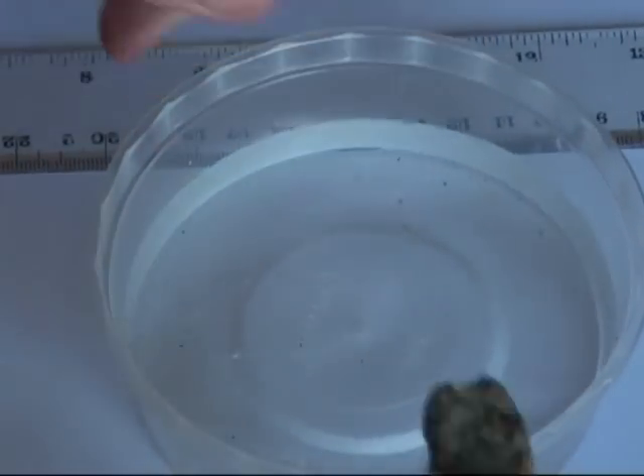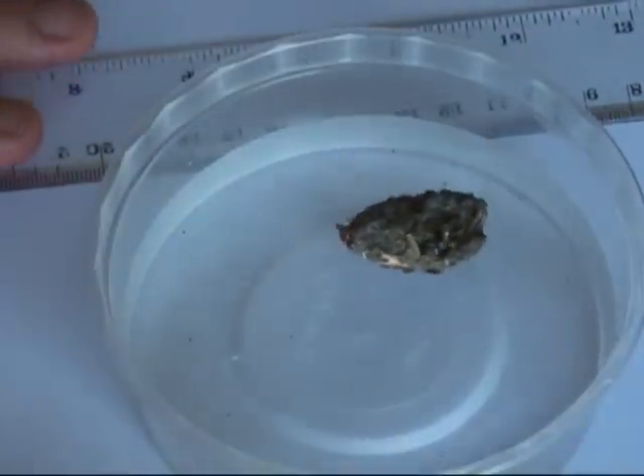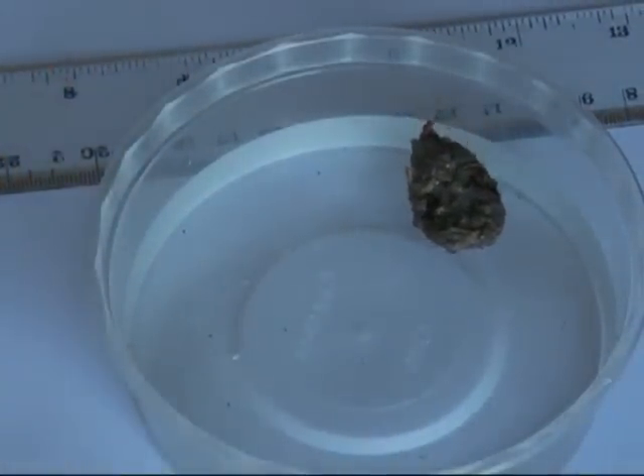Owl pellets contain regurgitated bones, fur, and feathers that the owl cannot digest. Examination of these pellets allows us the opportunity to investigate the diet of the boobook owl.